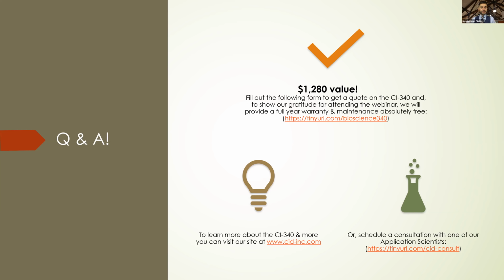How long can the instrument continuously acquire data, and what are the smallest time intervals it can record? I'm just wondering if you could do a 72-hour continuous testing. And yes, actually, we do have another, like a wall mount. Instead of running on battery, you just plug it into the instrument, and you can run it in more of a lab type setting and just have it keep going on whatever chamber you may design or that we provide and get all the data. And so each one of those time intervals, you can do it continuous. You can actually do it for just like 1 minute and the next minute, though I would highly suggest continuous. The data is very useful.